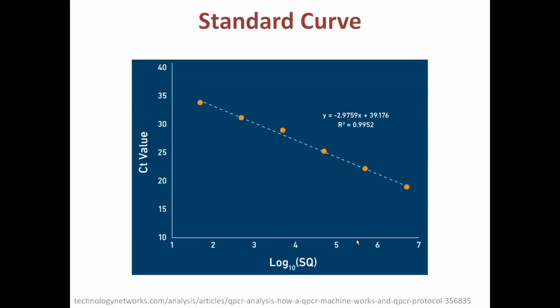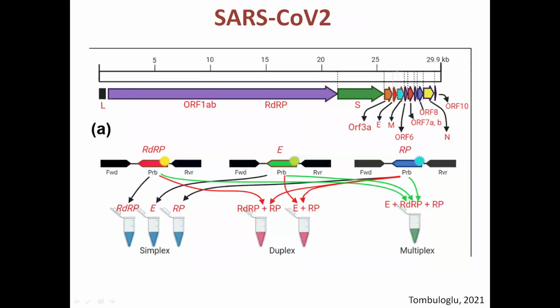So this is another importance of real-time PCR, that we can prepare the standard curve. This is the amount of template DNA we exactly know, and this is the time at which this amount of template DNA gives us the signal, the CT values. So if the amount of template is less, the CT is 35. If the amount of template is high, the CT is low. And from this, we can get the unknown quantity of template DNA, which we'll discuss in the exact data.